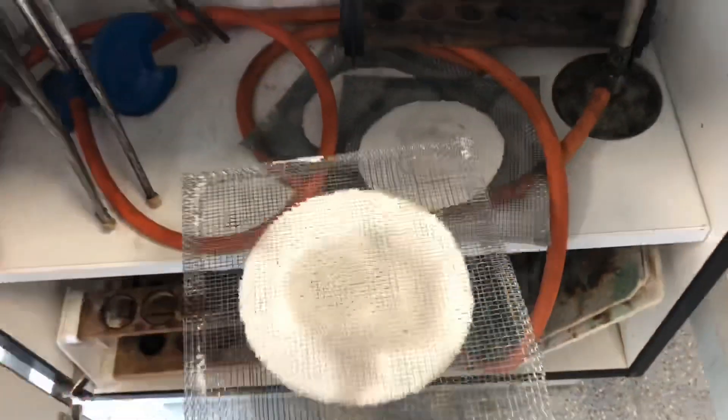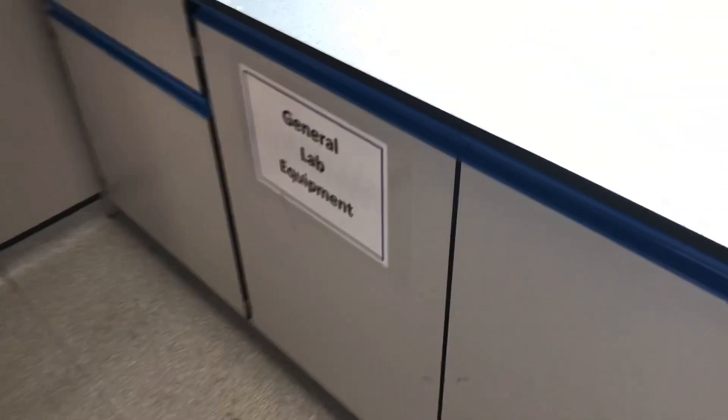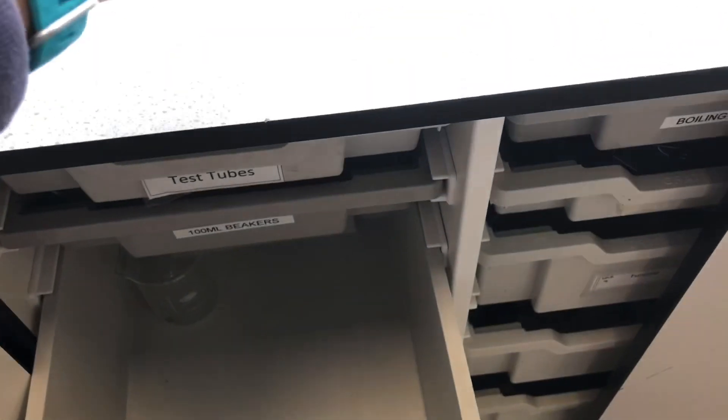I'm going to take a tripod and a gauze — this is what we sit our beaker on. With all of those bits and pieces, I'm then going to go over to my general lab equipment and get a beaker from there.